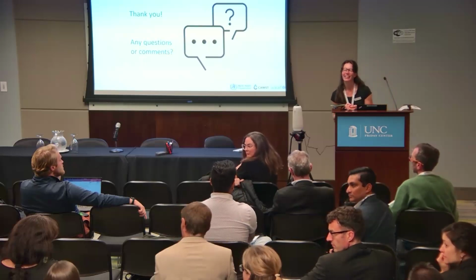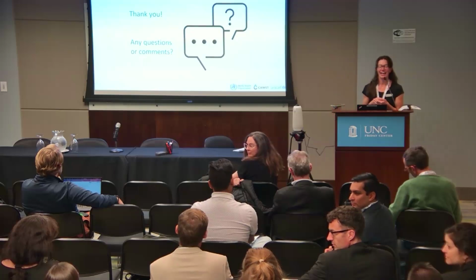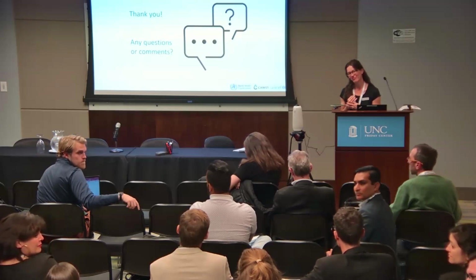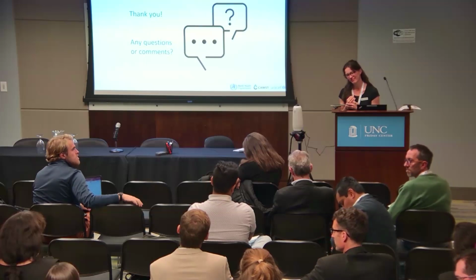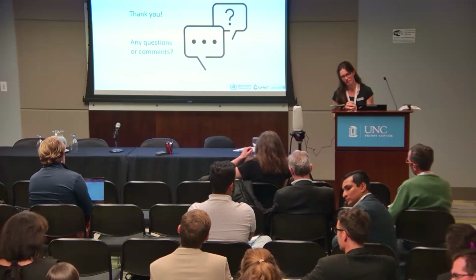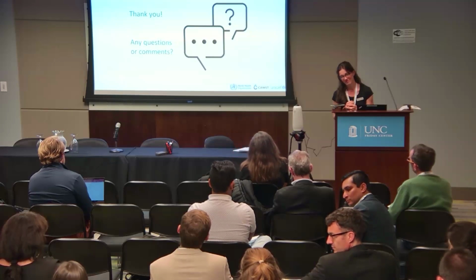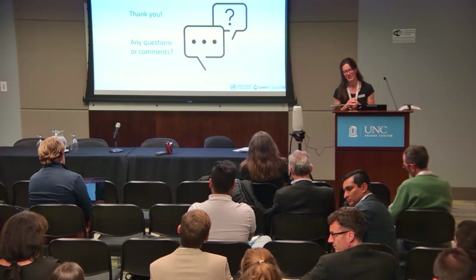Just wondering on the criteria side, whether affordability should be a part of that? Yeah, absolutely, it's part of that. Just thinking about consumables. Even though the practitioners are the ones purchasing and bringing this, in the end it goes to the community or the community groups that take over, and then the consumable localization can become an issue. So how do we balance that? Should that be taken into consideration?